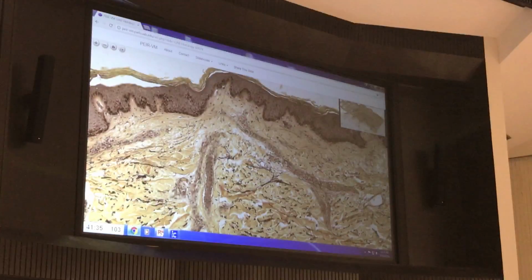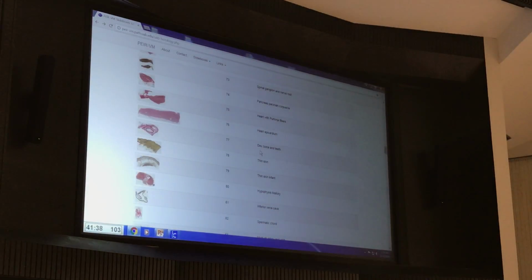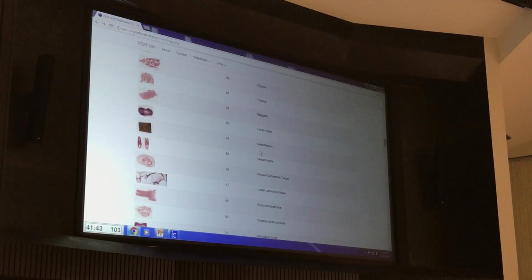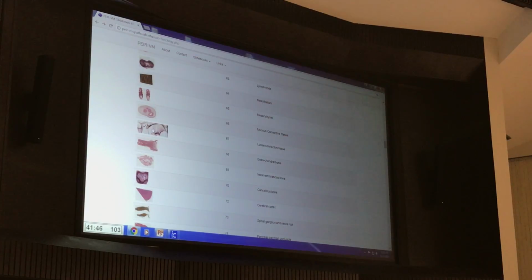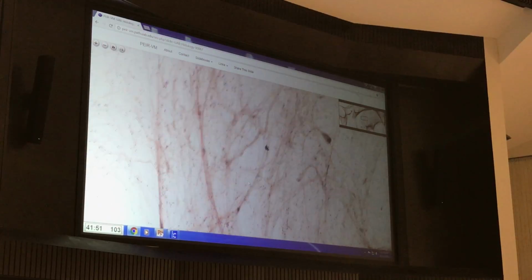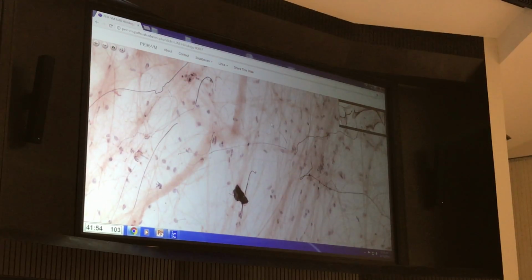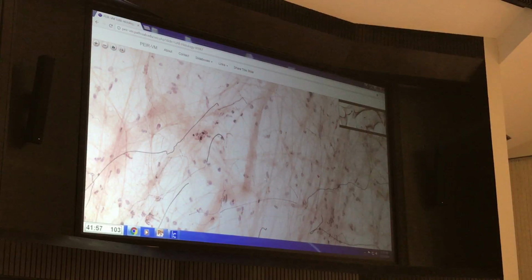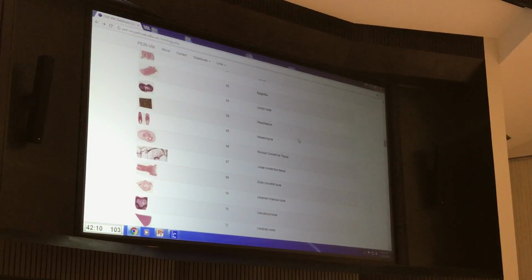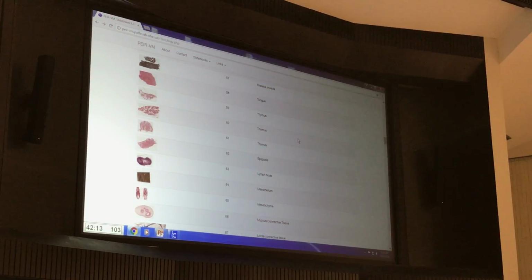Okay, let's look at this. What might you call this? They're just a loose connective tissue. Collagen, stain for elastic, and all of these are fibroblasts. This is a little mesenchymal, so undifferentiated, loose connective tissue during embryogenesis. And we haven't seen dense connective tissue yet.